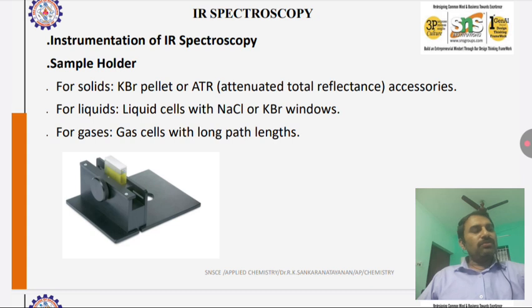Liquids can also be analyzed by infrared FTIR. So these are the things that we are using. One more method is called the ATR method, attenuated total reflectance. This is Fourier transform infrared spectroscopy.